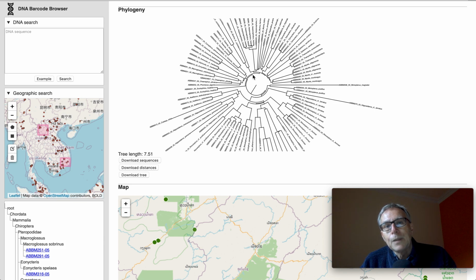You could start to think, maybe we could use this as a measure of biodiversity using this phylogenetic structure. We've got two different regions in Southeast Asia. We've sampled roughly the same size area. We've got very different results. Now, obviously, in this example, there are probably all sorts of reasons why we have different samples. But there's a lot of potential here. You could imagine dividing the world up into a grid of roughly equal sizes, sampling the barcodes there, measuring phylogenetic diversity, what kind of tree structure we have, and using that as a way to assess biodiversity.